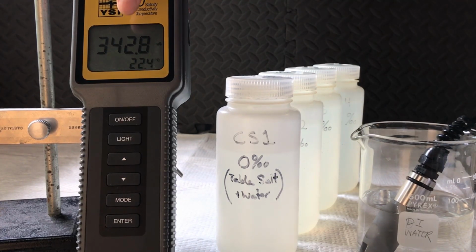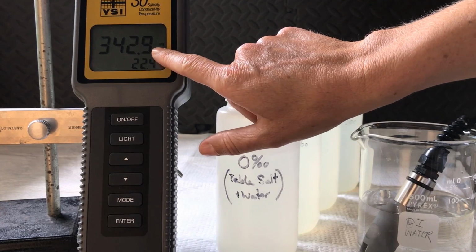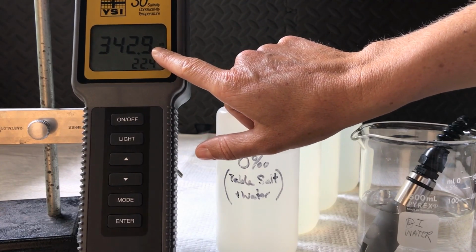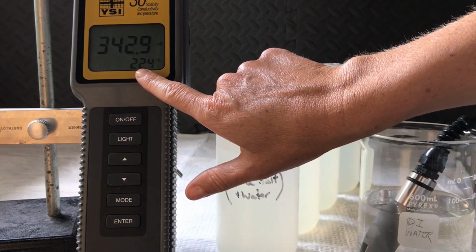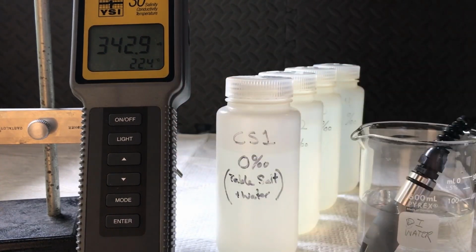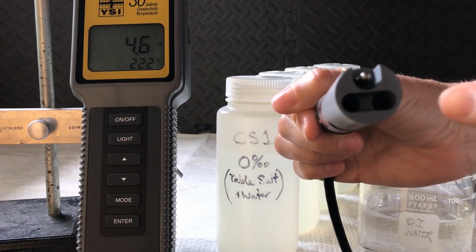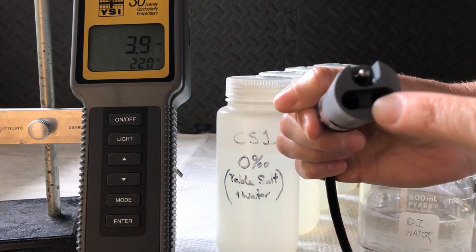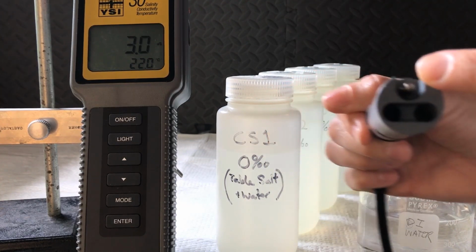So on the meter, the conductivity are these larger numbers. The units are here. Right now it's sitting in microsiemens, which is a smaller unit than millisiemens. I'll let you know when it changes to millisiemens. And this is the temperature of the solution in degrees C, which you will not need to record. The probe looks like this. It measures the conductivity across the 2 plates that are down here, and this measures the temperature of the water, or the solution.